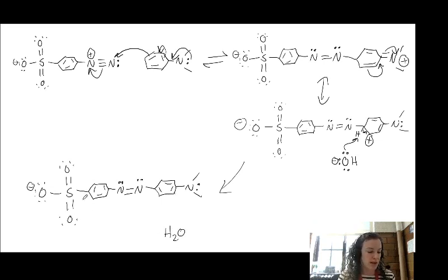So you can see, folks, that now the conjugation extends throughout the entire molecule. This is actually the most conjugated product we've made so far in this lab.